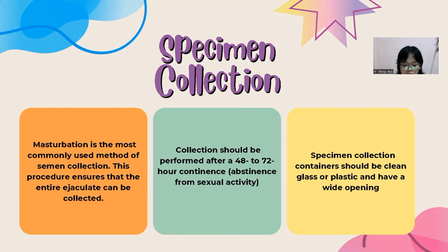Specimen collection. Specimen collection containers should be clean glass or plastic and have a wide opening. Specimens awaiting analysis should be kept at 37 degrees, and extremes in temperature must be avoided.